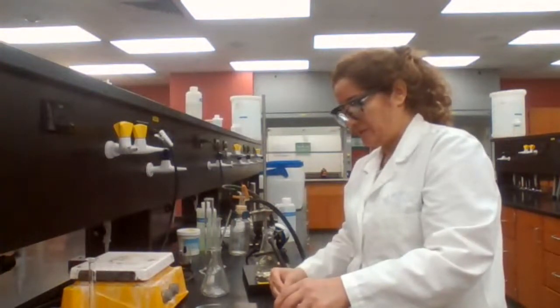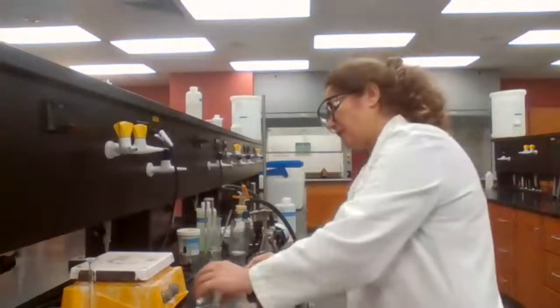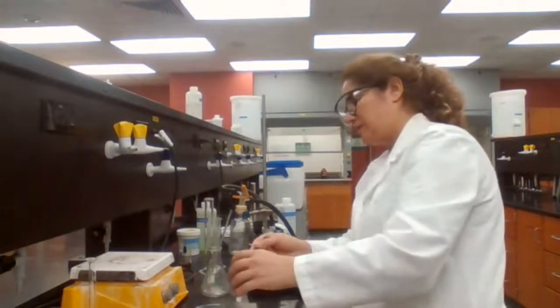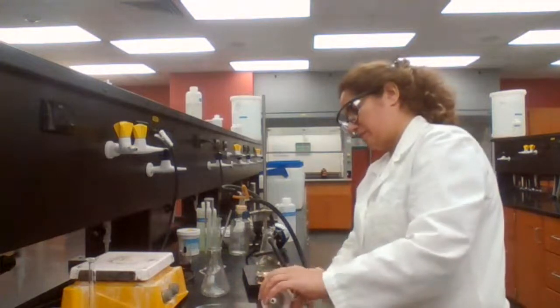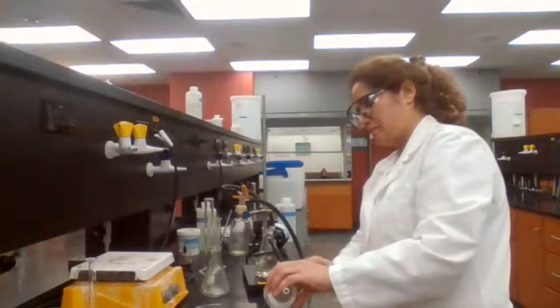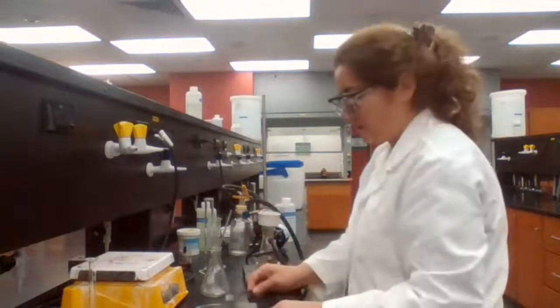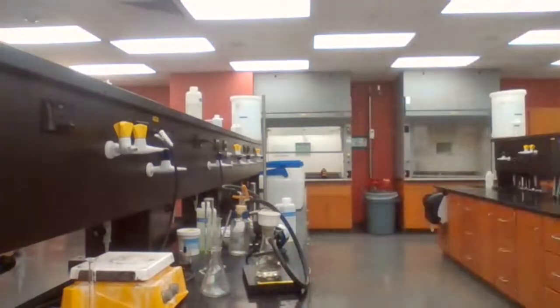I'm going to take the sample and place it in the oven.